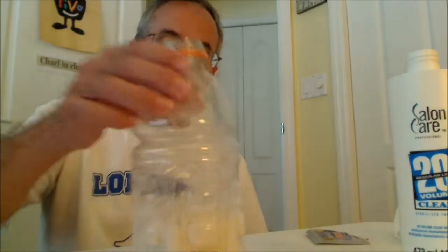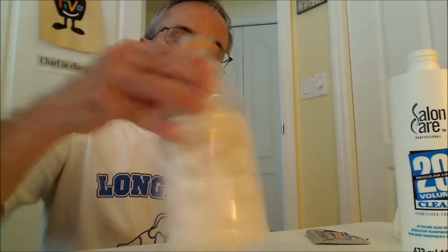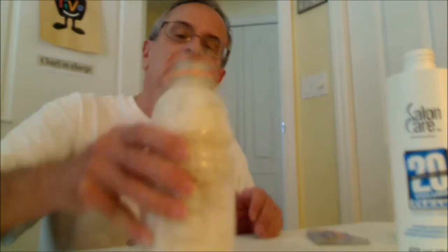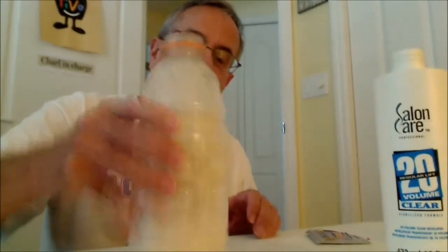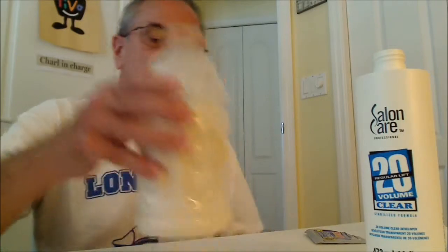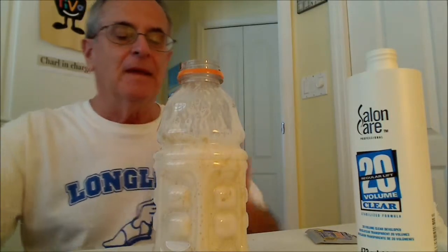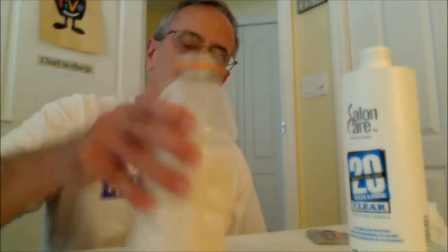You can see it really flares up. I'm going to keep shaking it and it's very warm. Whoops. Be careful. It is a strong oxygen. Probably 3% would be better. It's so hot that the steam is coming off.